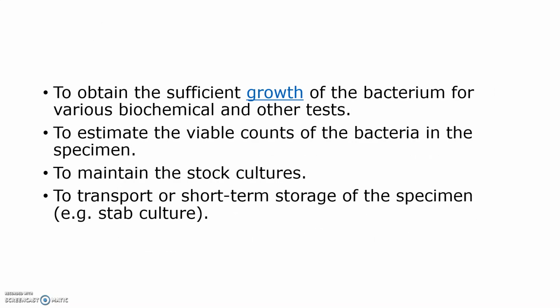And also to obtain sufficient growth of the bacterium for various biochemical and other tests, to estimate the viable count of the bacteria in the specimen, to maintain stock cultures, and for transport or short-term storage of the specimen, for example in the case of stab culture.